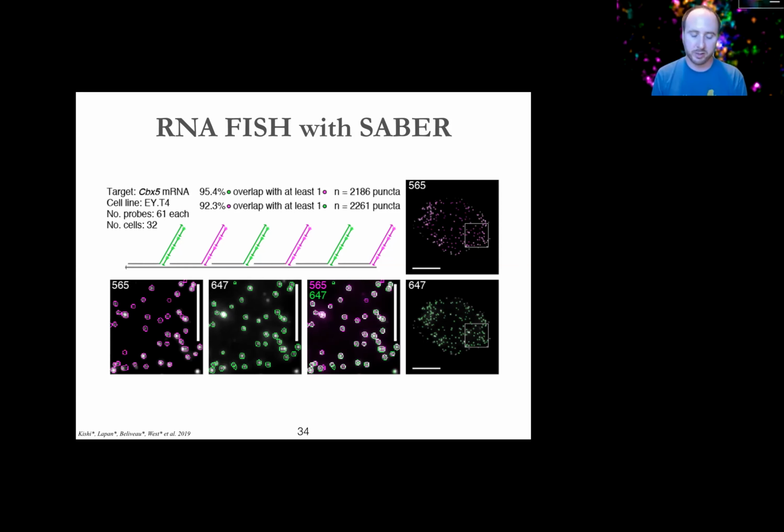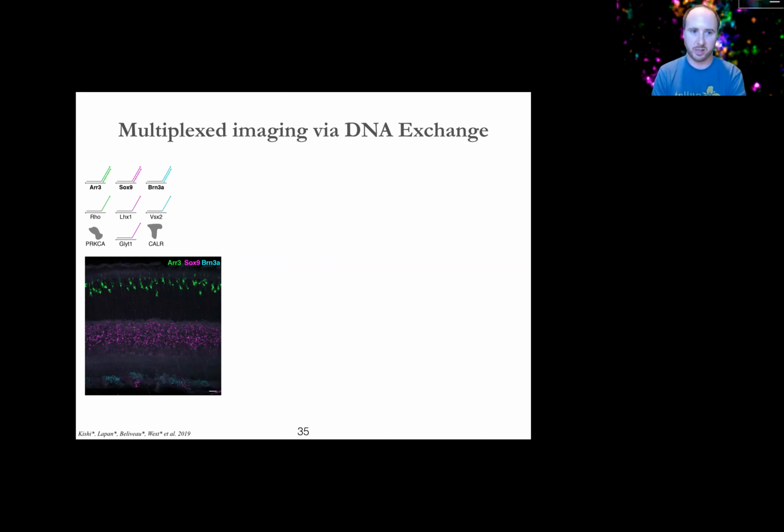So what we can do with SABER, in a very similar way to what we were able to do with the DNA paint, is program distinct sequences to concatemerize in the PER reaction and then recognize with the fluorescent detection oligos. So here's an example of that where we have 7 different RNA targets, and we're going to add 2 protein targets at the very last step. This is in mouse retinal tissue, work by Sullivan Lappin and Emma West in Connie's lab, who did all of the sample prep and imaging here. They've hybridized all 7 RNA probes in one step overnight, and then added in a secondary hybridization the fluorescent oligos for the first 3 targets in 3 distinct fluorescent channels.